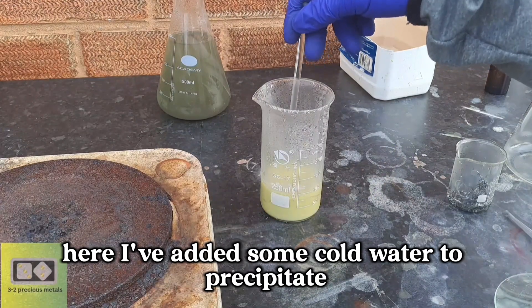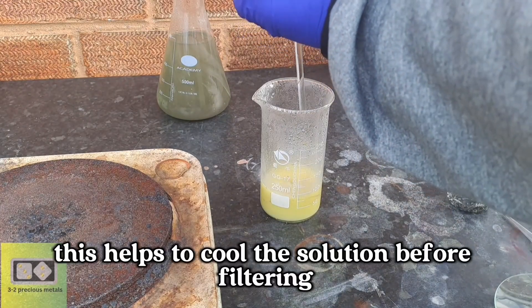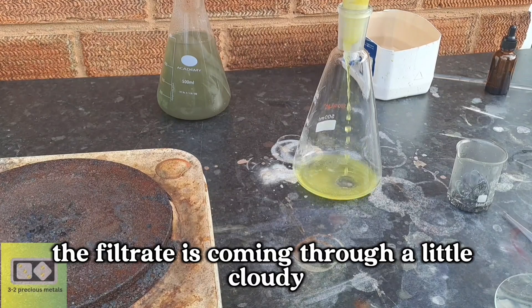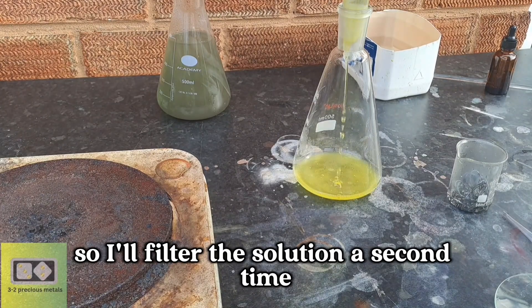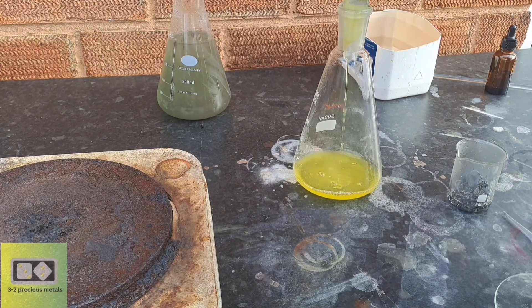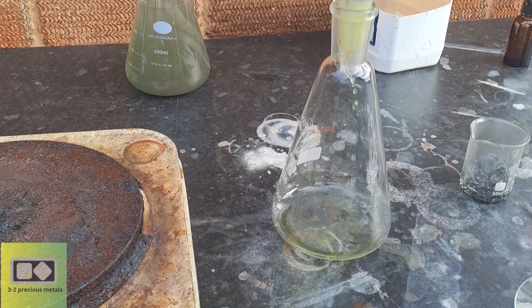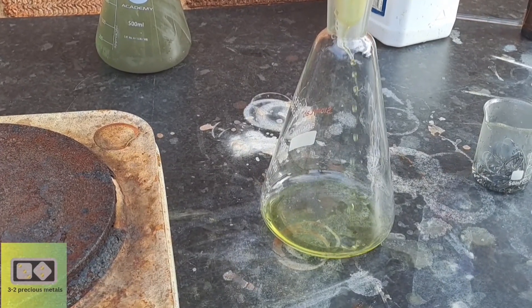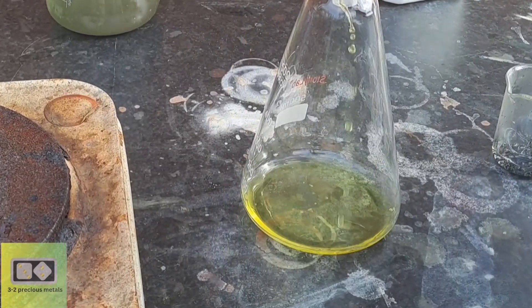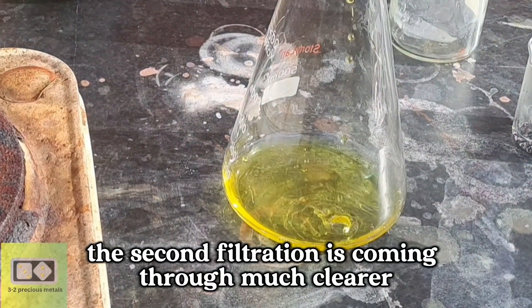I've added some cold water to precipitate any silver chloride that may be present. This helps to cool the solution before filtering. The filtrate is coming through a little cloudy, so I'll filter the solution a second time through the same filter to clean it up. The second filtration is coming through much clearer.